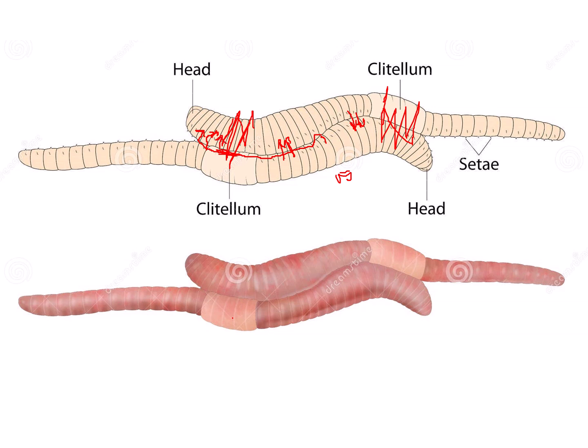And similarly, the sperms from the male genital pore of the first earthworm would come out, run along the length of the body along the seminal grooves, reach the clitellum and enter into the spermatheca of the second individual, and they would remain stored.